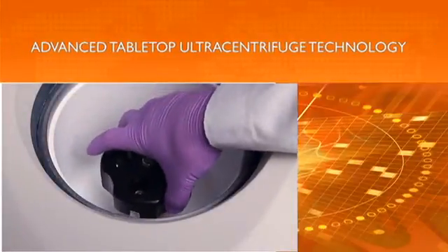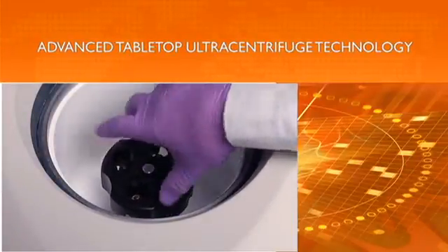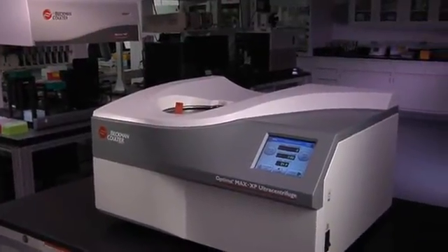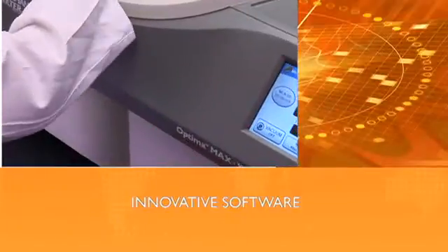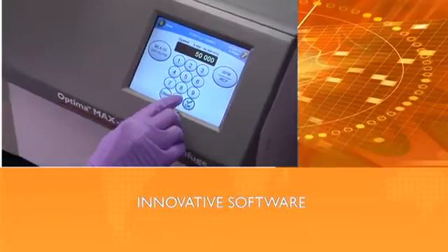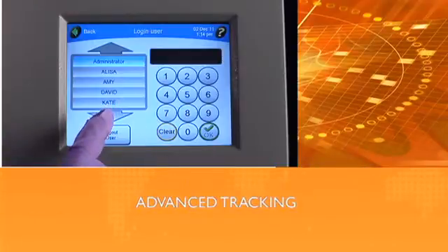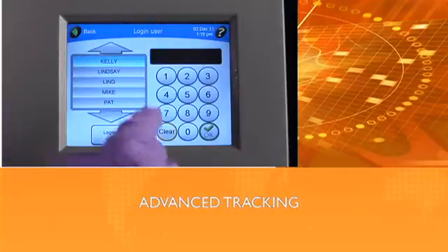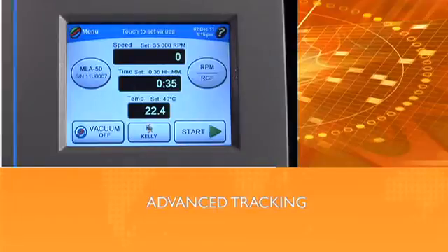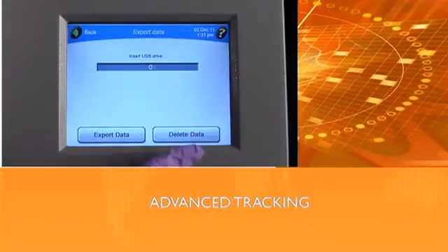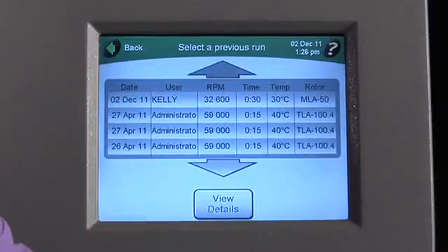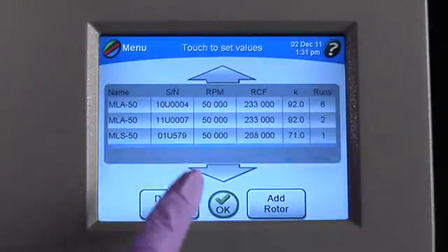The Optima Maxx series represents the latest in advanced tabletop ultracentrifuge technology and provides a virtually limitless number of user-defined programs. The Maxx series' highly flexible software enables users to set multiple programs with up to 5 steps each. The Optima MaxxP's advanced software includes features that support electronic record keeping, such as password-controlled access and audit trail documentation to maintain compliance. The MaxxP also monitors and records individual user and run data and manages rotor life by serial number.